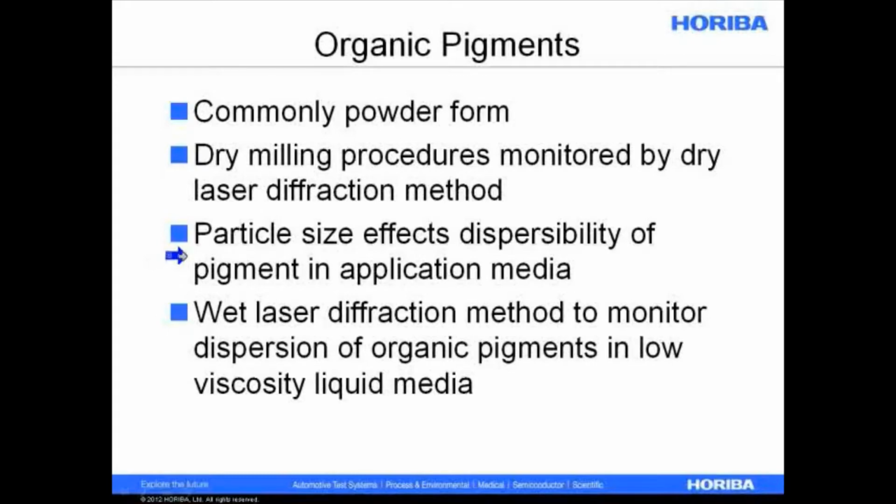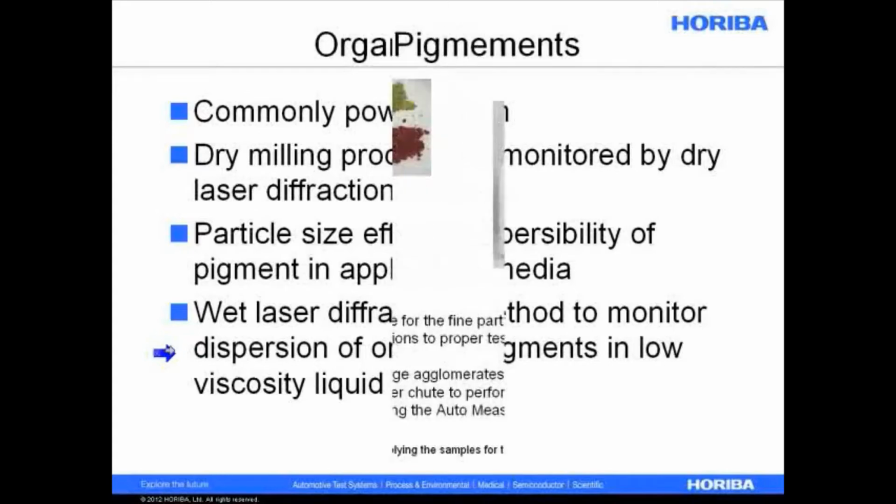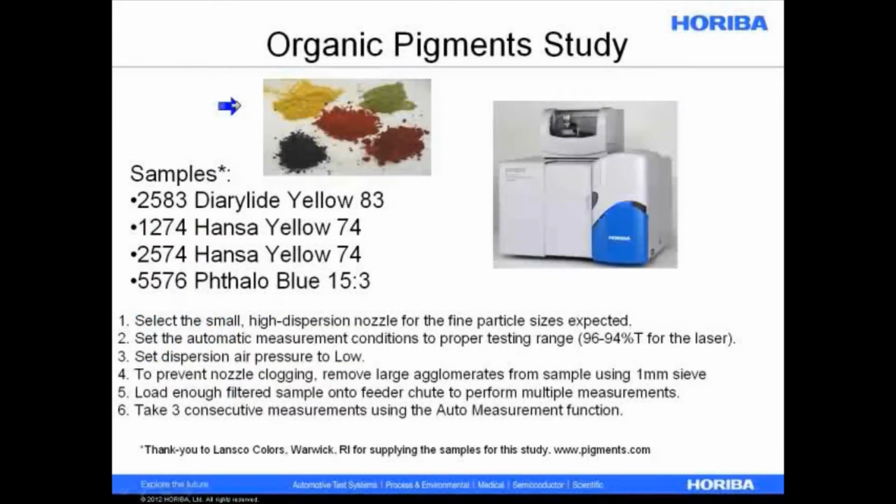But if we're looking at particles dispersed in a pigment, then perhaps we're doing wet measurements, and then we'll show you data from the LA950, both measuring powders as dry powders and dispersed in liquids. So for organic pigments, there are lots of people using laser diffraction for these measurements.